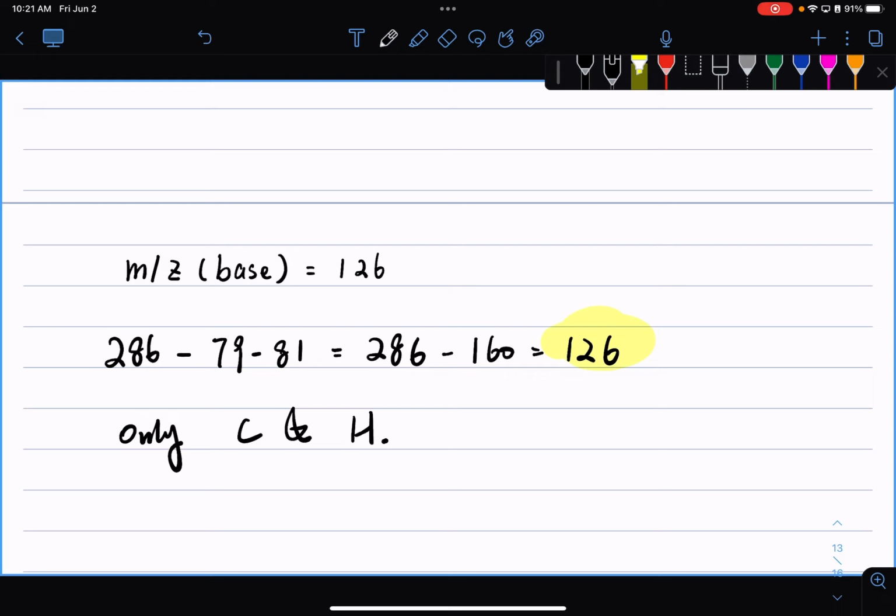Right, so that's the fragment cation that's being formed after dissociation of the 2 bromine atoms from this mysterious molecule. Now we can get even more information by looking at the molecular mass of this fragment, 126. It only contains carbon and hydrogen, so we can easily derive the ratio between my carbon atoms and my hydrogen atoms and calculate the degree of unsaturation.